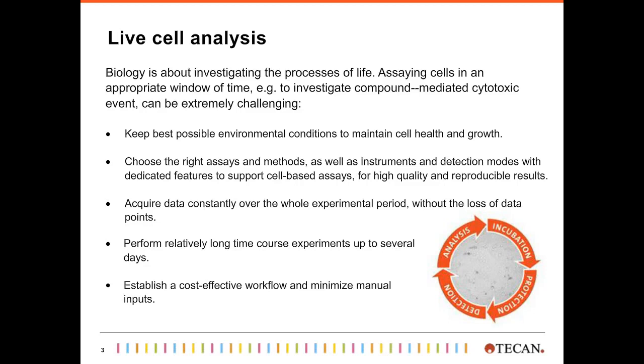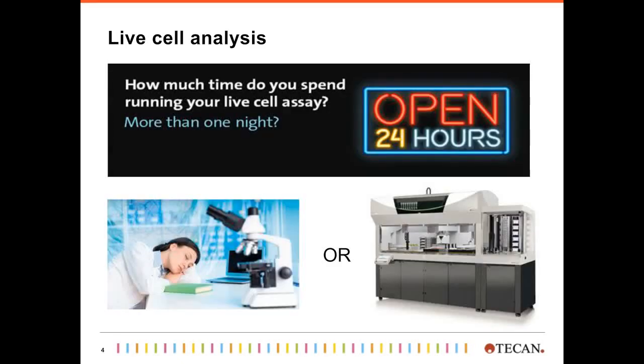And as always, the whole workflow, the whole procedure needs to be relatively cheap and should also have a minimum of manual inputs, of course. So basically two solutions or two approaches are well known. The one is what I did during my PhD study, sleeping in the lab, getting up every hour and acquiring data points to get a full data set over several days. Or you simply do it with a robotic system, but then budget should not be any issue in your lab.